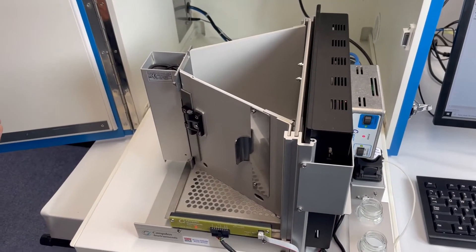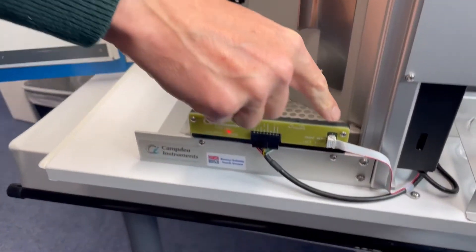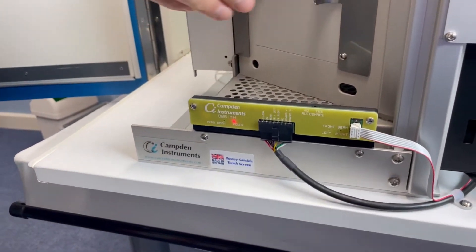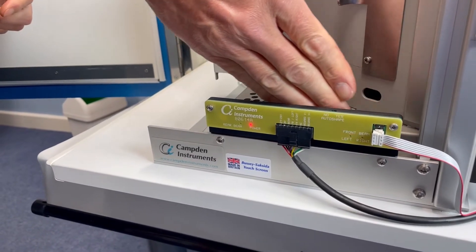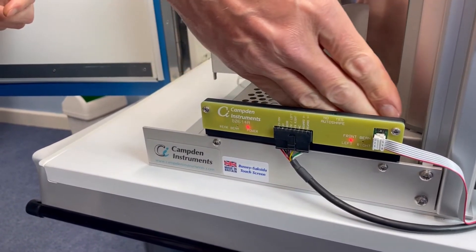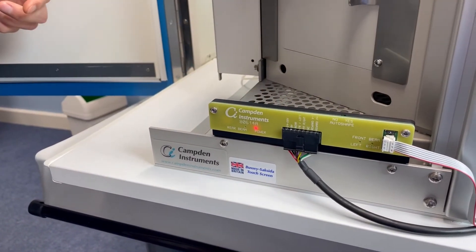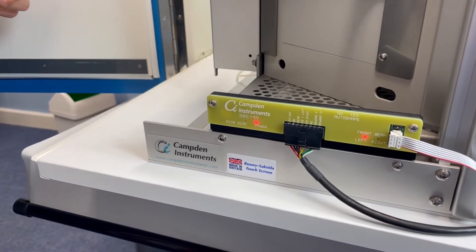The IR ambulatory beams, seen here, have increased sensitivity and now feature a quick test facility inside and outside of the chamber.